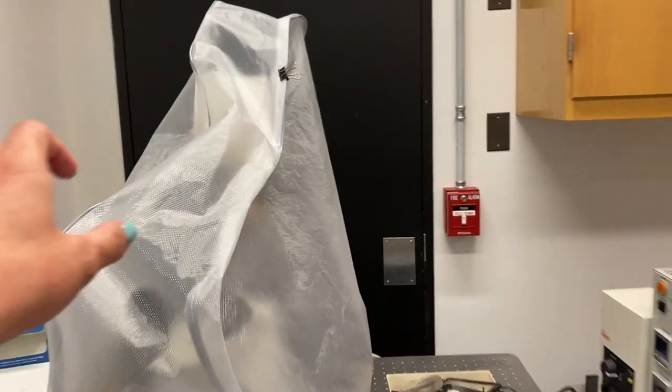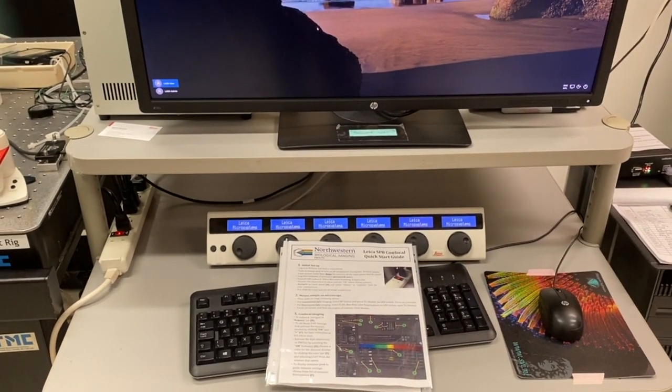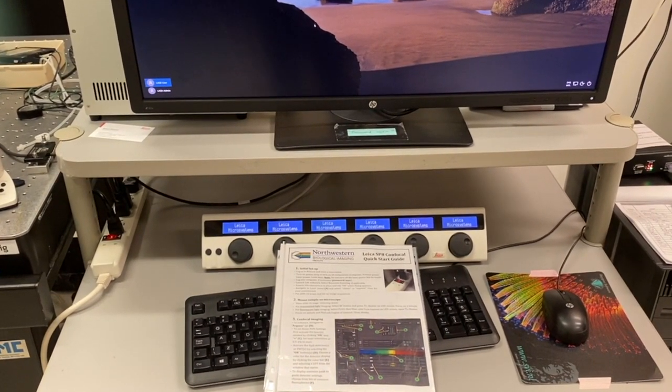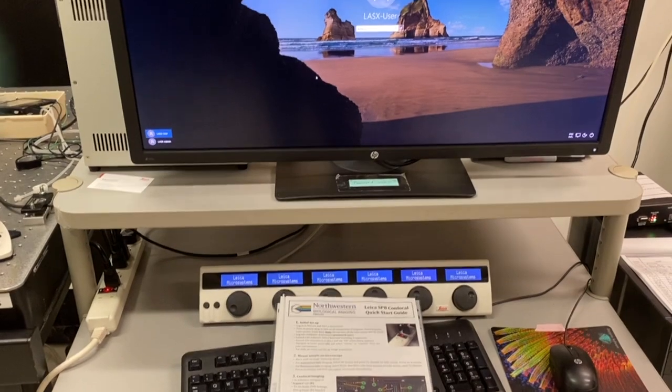There is a hook near the door for the microscope cover. There is a quick start guide available for the SP8. The sheet should be in a sheet protector somewhere near the PC, and this could help you get started if you have any simple questions.